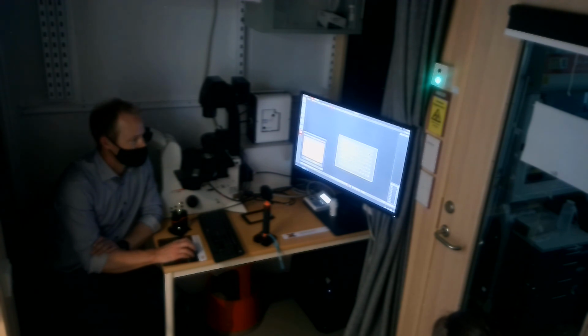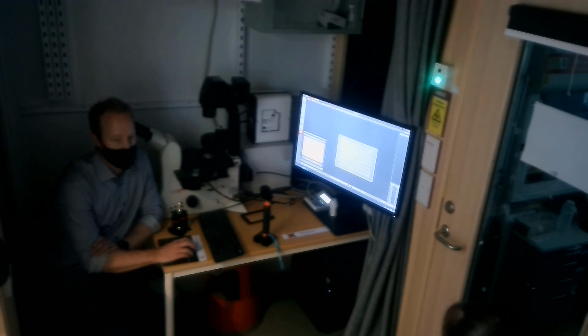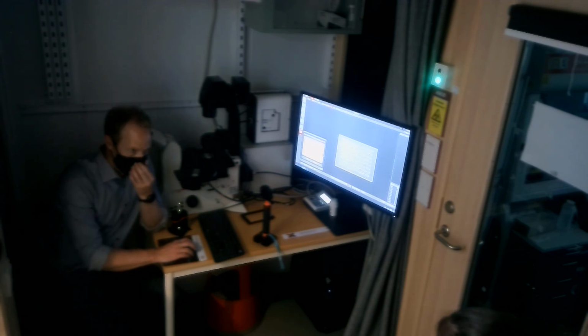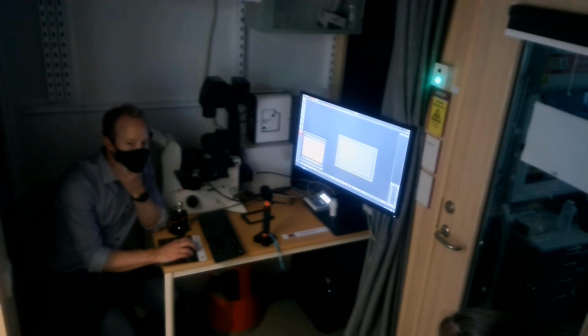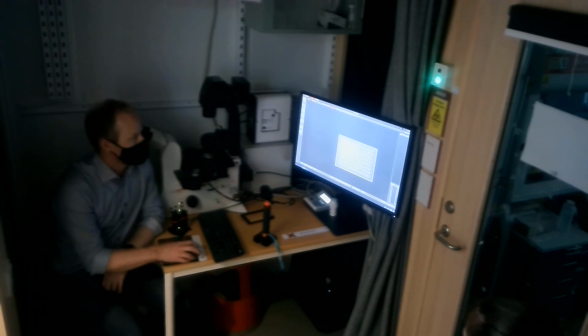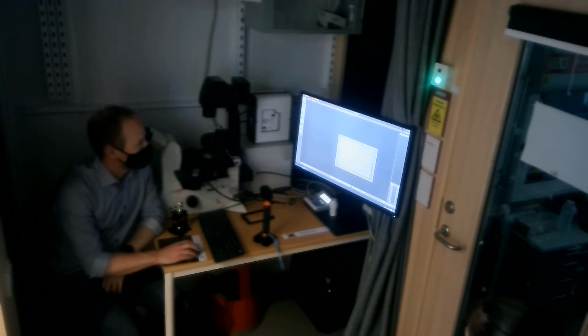Do you follow this part? But here, then I have to set the focus before, right? The focus map is setting it before. Okay, but at the navigator, not in the previous. So here I can set everything at the navigator, right? So I don't have to use the default interface. No, you can set everything here.